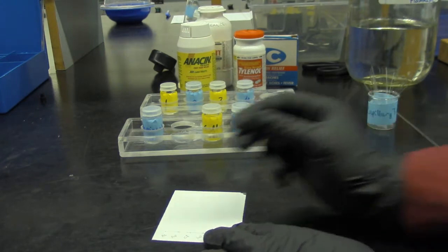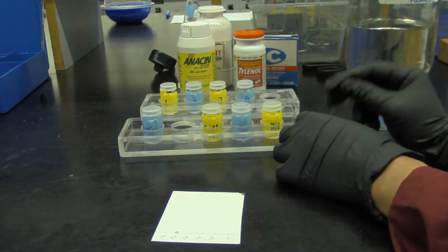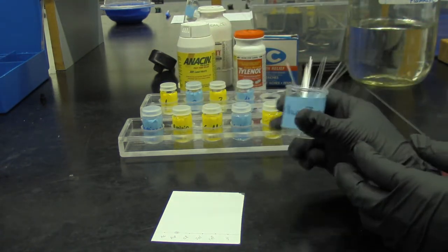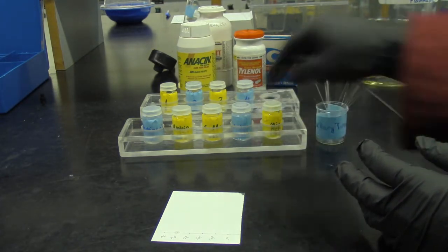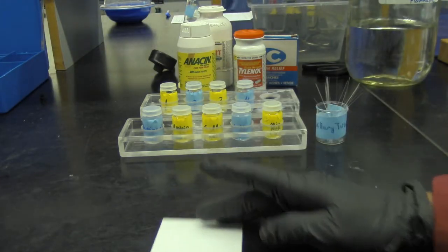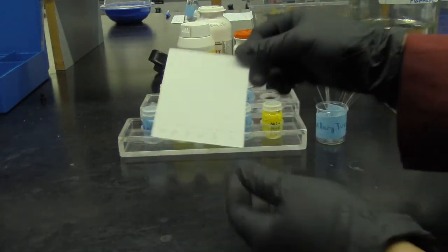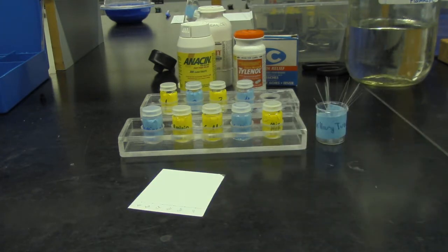I spot aspirin a little more because it's difficult to see under UV light. So you notice I'm making sure that I'm using new capillary tubes for each standard, right? I do not want to cross-contaminate all the standards and then I can't figure out which compound is what, okay? So stay a little bit wet, so shake it dry, right? So I'm going to do this until the number 4, okay? You don't have to watch all these.